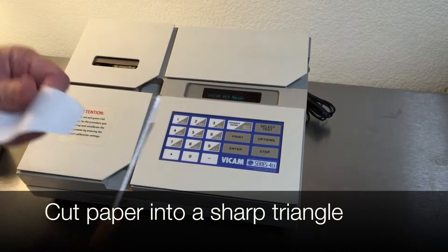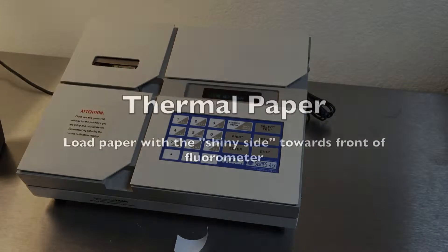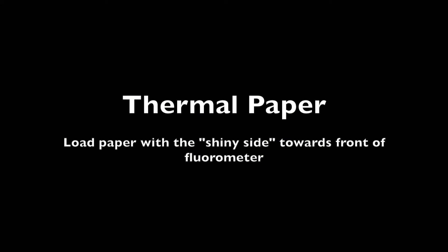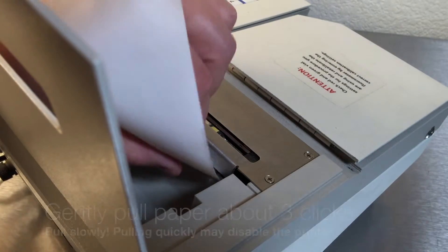With a pair of sharp scissors, cut the paper into a sharp triangle. Load the paper with the shiny side towards the front of the fluorometer. Slide the paper into the printer slot until you feel resistance.